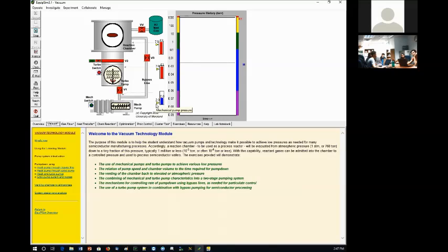What do I see here? Does it go below 2.3? No, that's millitorrs, right? 2.3 millitorrs. I'm not surprised, because mechanical pumps can only take you down to this kind of 10 to the -3 range. Do you guys remember from the first week? That's the level where the mechanical pumps can take you. That's why they're called the roughing pumps, because that's their main idea. It's just an intermediate level pump.